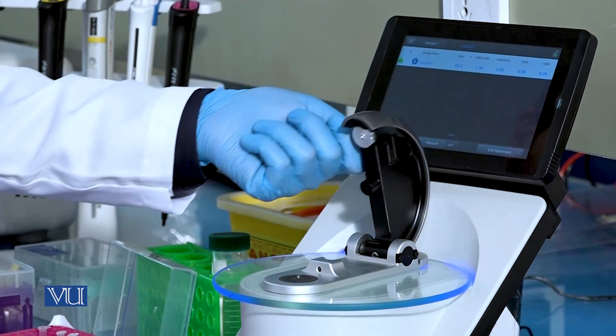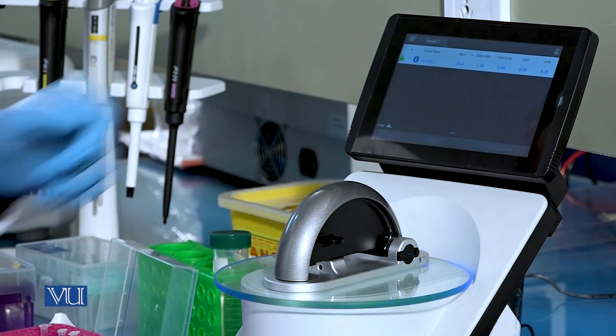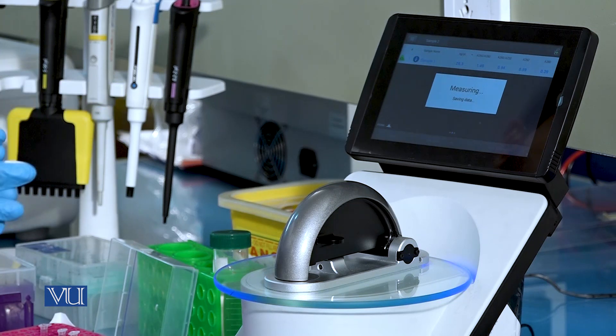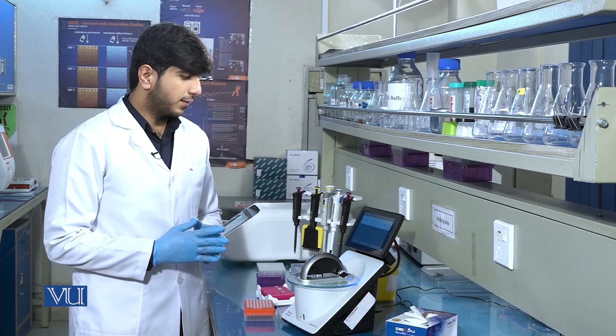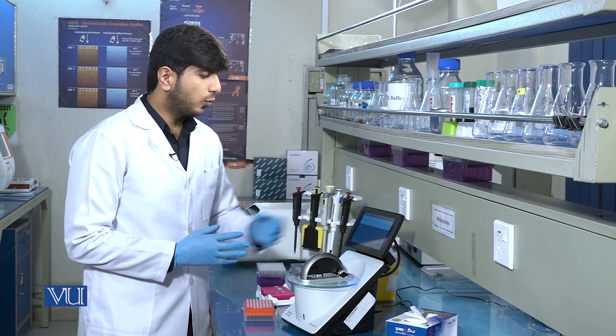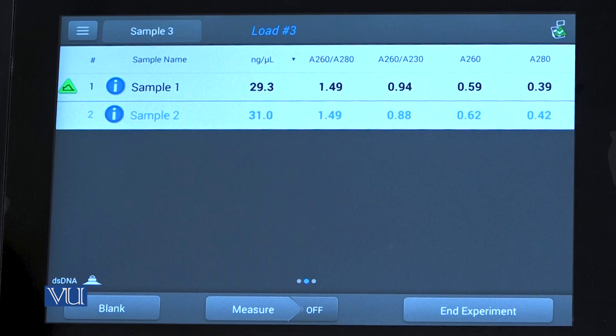After pouring the sample, we will close the paddle and click on measure. The NanoDrop instrument will measure the concentration of DNA. Here you can see that in sample 2, the concentration of DNA is 31 nanogram per microliter, and the purity of the DNA is 1.49, which is the A260/280 ratio.